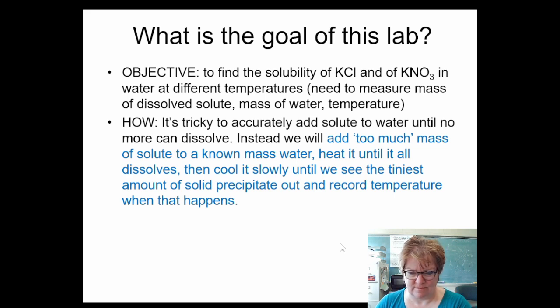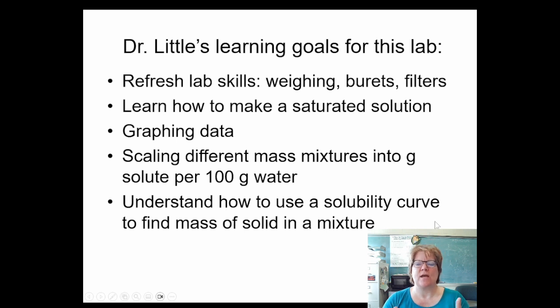All right. So again, we're going to rehash some skills: weighing, burettes, filters. Really, you've already done all that, but we'll be using those today. Learning how to make a saturated solution. So how do we get it to the point where it's saturated, at which we're going to call it solubility?